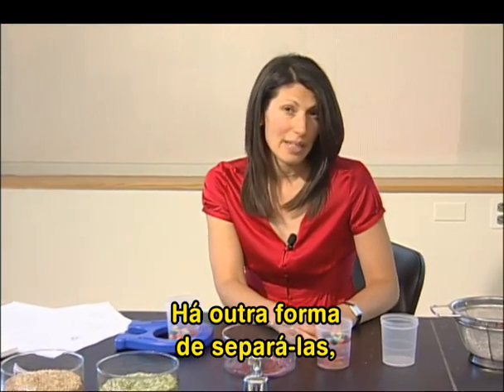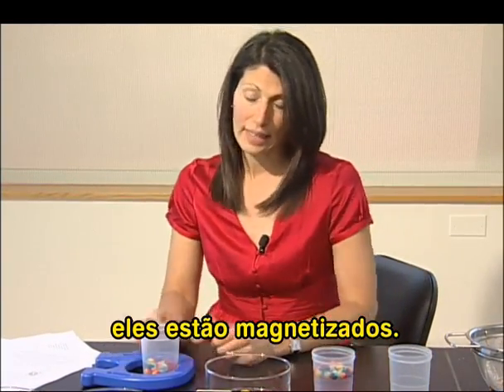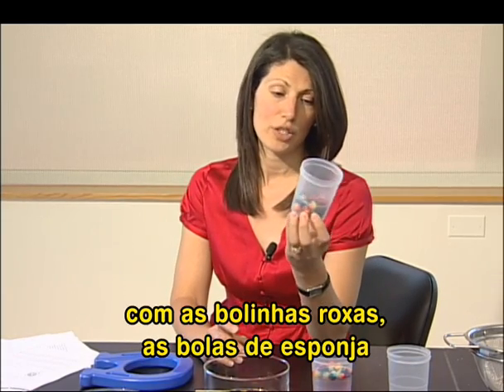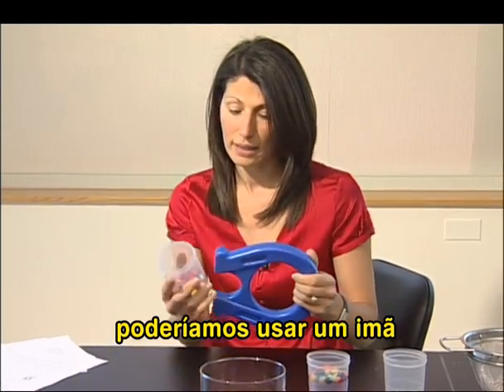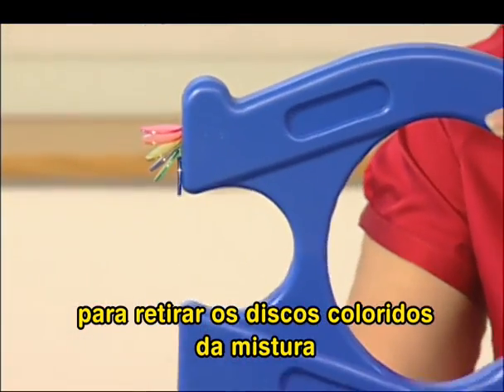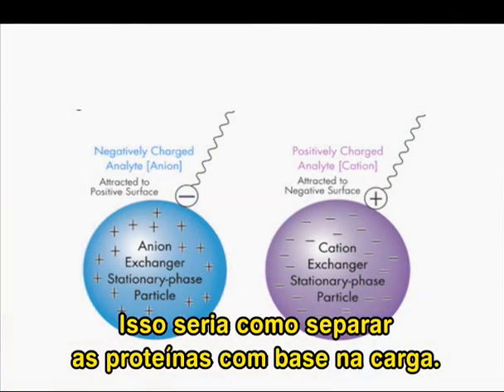There is another way to separate them out, and that's because I know something about those flat, colorful discs, and that is that they're magnetic. So if we still had our very simple cell, a mixture of the small purple dots, the puffballs, and the flat colorful discs, we could use a magnet to pull the flat colorful discs out from the mixture and separate them that way. This would be akin to separating proteins based on their charge.